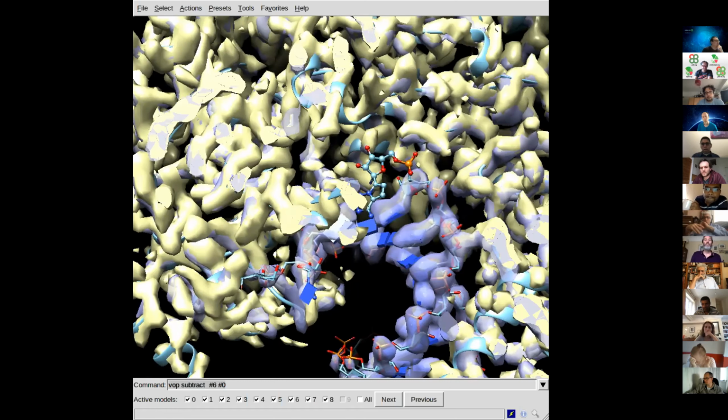So how are you scaling these two maps together? Okay, I haven't done any particular scaling. So it's all at face value. So as I said, B factors could be balanced. I was thinking the next step I would do is run this sort of log scale of both against the given models.